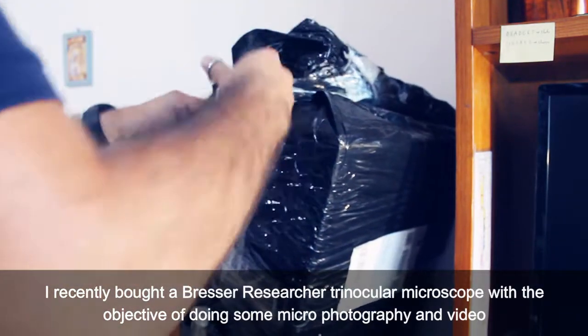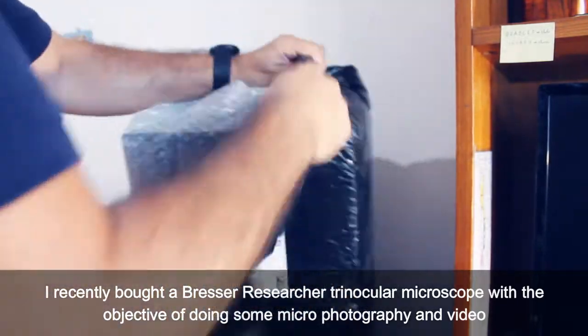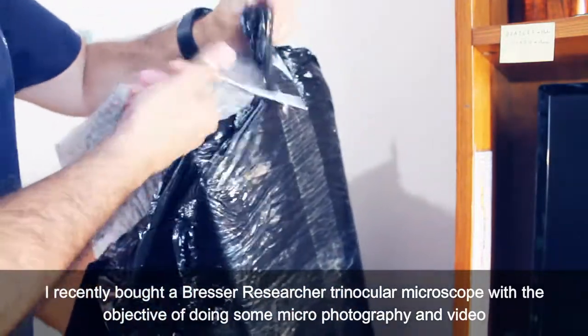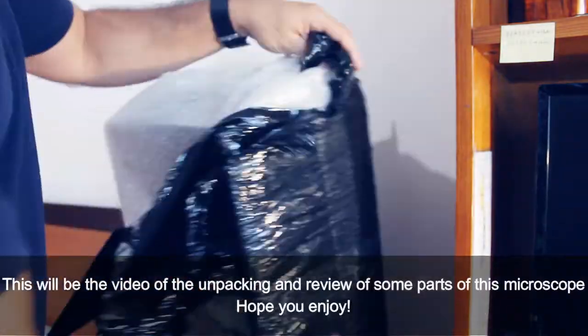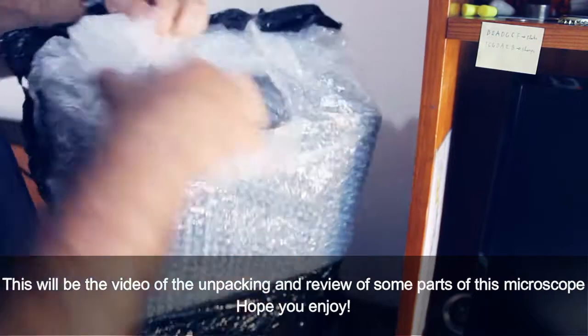I recently bought a Bresser Researcher Trinocular Microscope with the objective of doing some micro photography and video. This will be the video of the unpacking and review of some parts of this microscope. Hope you enjoy.